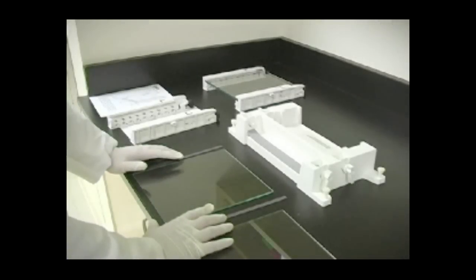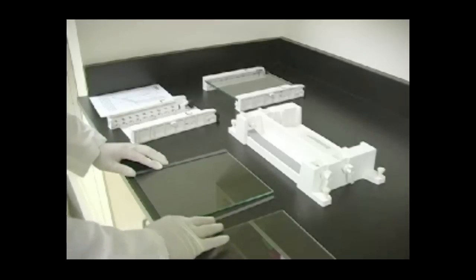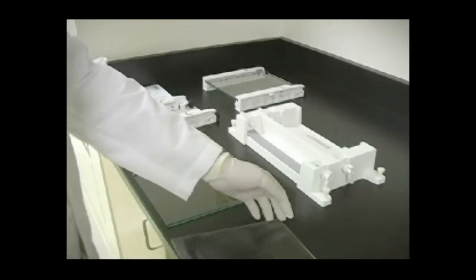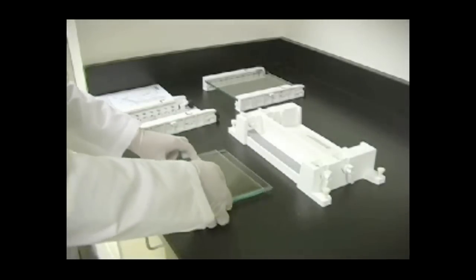To begin assembly of the gel cassettes, lay the long outer plate down. It should be 20 cm in width by 22.3 cm in length. Place narrow spacers along the long edges of the plate. Then place a short inner plate on top of the spacers. It should be 20 cm by 20 cm.